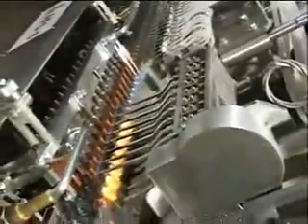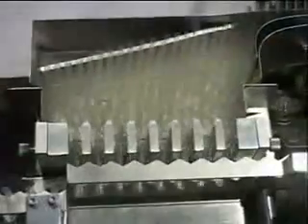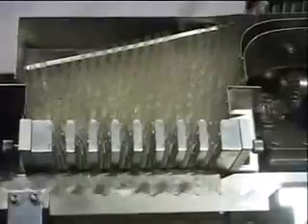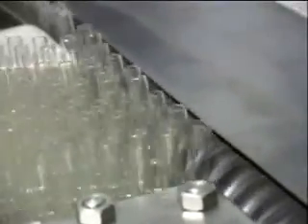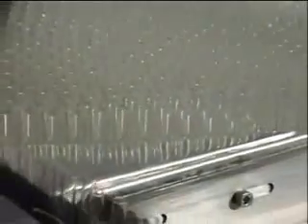The machine produces 80,000 to 1 lakh ampules per shift with full machine in operation. It is available with SS Mesh Gen for automatic feeding of washed and sterilized ampules directly to the filling and sealing machine, or with an SS Feeding Hopper. The ampules are paired with SS-3.